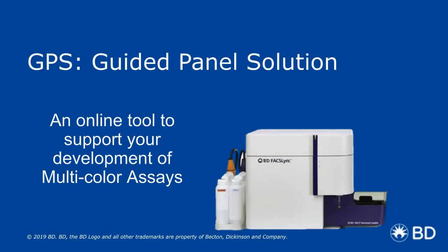So what I'd like to take you to next is, we've been teaching these principles for a number of years. For those of you who have attended our Horizon tour, the early ones, version 1 and version 2, this will all look familiar to you. If you want to get a little bit more in depth on this, you can go back and look at those lectures. But I now want to take you to a tool that we've made available in the last year or two, and this is GPS, or the Guided Panel Solution.